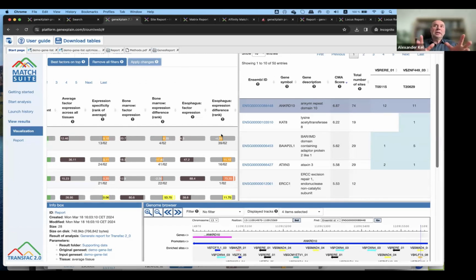So you would select the tissue from the very beginning, and I guess you will show it next, of course, in a moment. And then in such case, the tissue expression will be involved from the very beginning in selecting the particular matrices to use. So it's a little bit different approach here, but this is really for filtering. This is really to fine-tune your results.